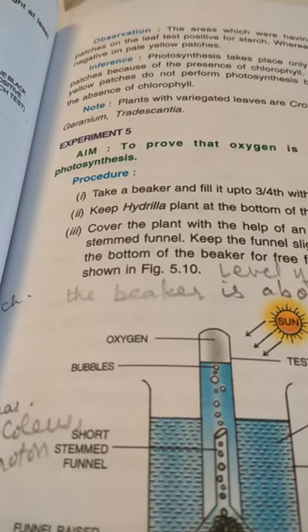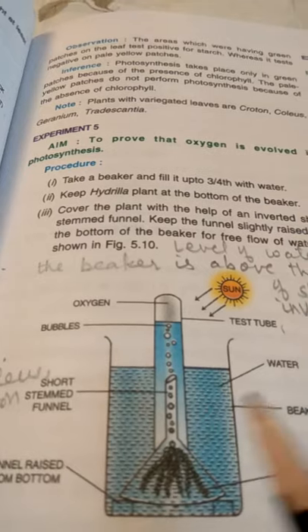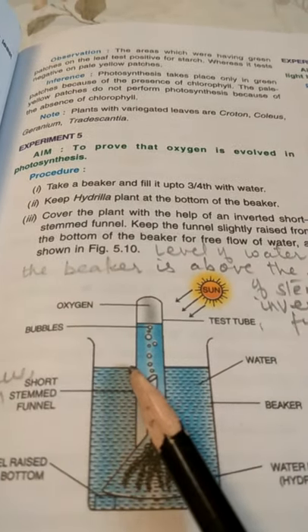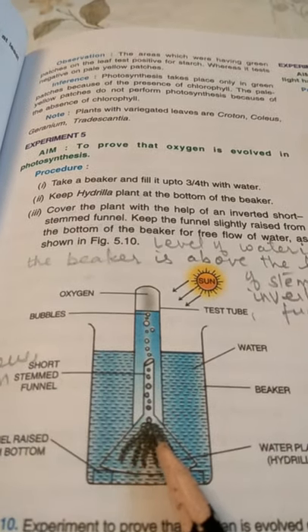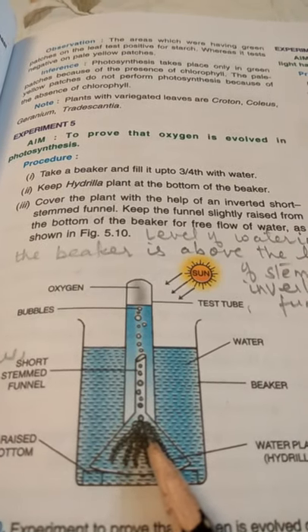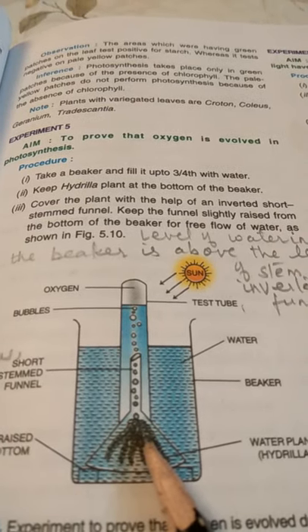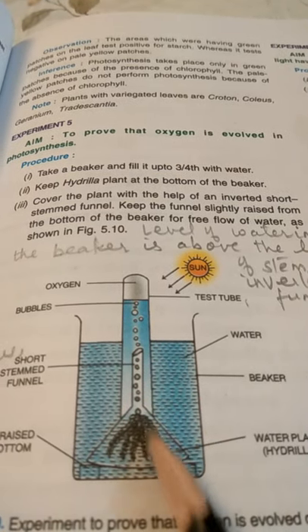...and chlorophyll, they prepare food in the form of glucose and oxygen is evolved. We'll prove this by an experiment. We will take a beaker and fill it up to three-fourths with water, then put a Hydrilla plant at the bottom of the beaker. Hydrilla is an aquatic plant which can absorb the carbon dioxide dissolved in water.